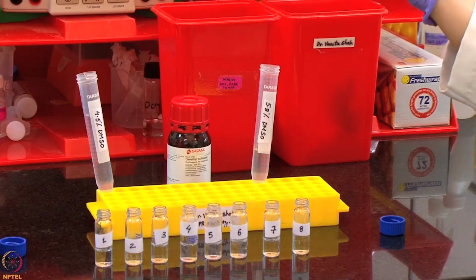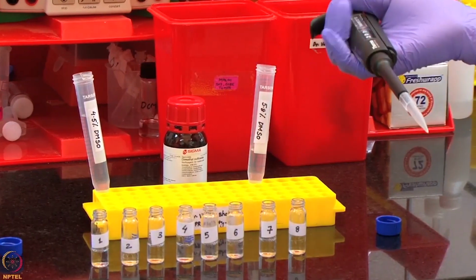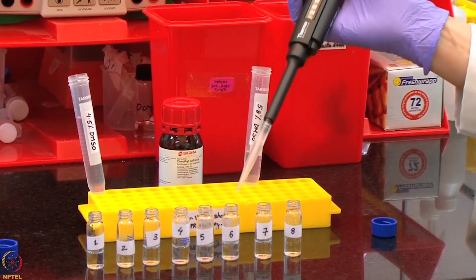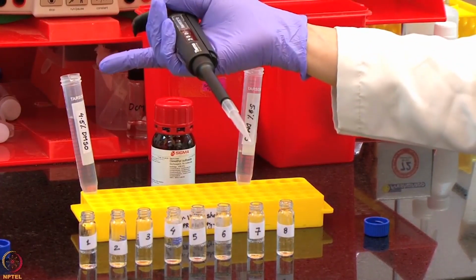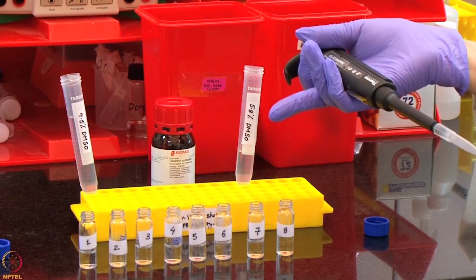To reiterate, we have numbered the tubes as 1 to 8 and added 200, 400, 600, 800, 1000, 1200 and 1400 microliters of 4.5% DMSO in tubes 2 to 8 respectively.